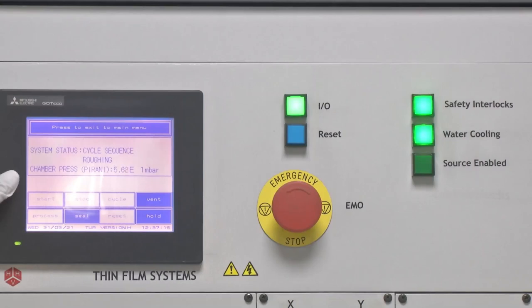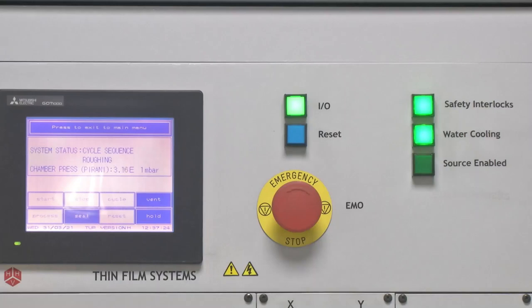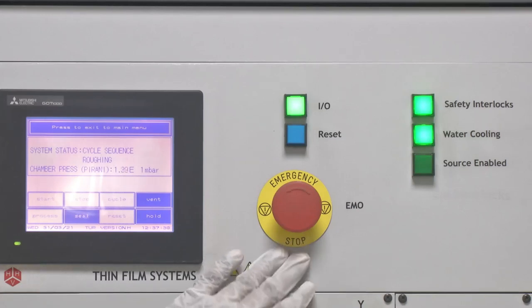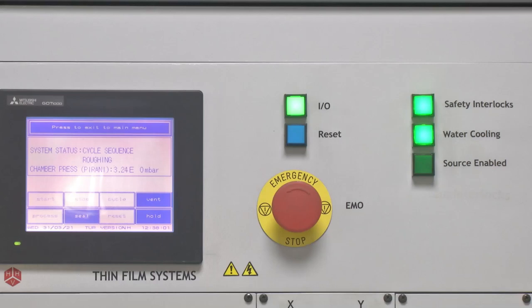Once the chamber pressure reaches around 10 to the power 1 millibar, the safety interlock indicator turns on and is highlighted green. Another important part of the system is the emergency stop button. This is useful when there is any system issue — such as vacuum being stuck, or limited power supply through UPS in case of sudden power interruption. The emergency stop button completely shuts down the system to prevent further damage to the chamber, electronics, and the user, preventing shock or fire. It should only be used for emergency cases.